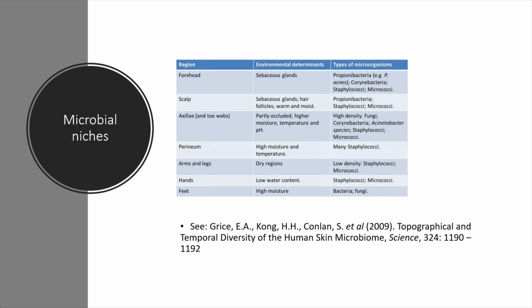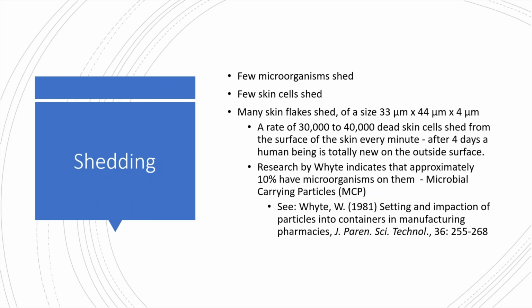So this information again is fairly useful background information if we do start seeing particular types of organisms found in particular changing rooms or clean rooms, and we do have worries about gown control, mask control, glove control, then potentially there may be a connection here that we can relate the data back to. I also mentioned about shedding.